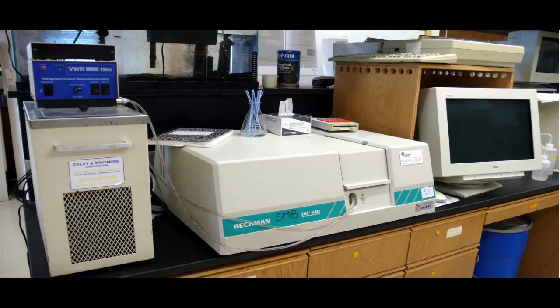The image shown is of a UV-VIS spectroscopy machine. The input of the machine is in the middle where the cuvettes are loaded in preparation for this machine to read. The analysis of the samples is done on the left side where they go through and get light shined on them. And on the computer, the quantification and graphs are shown of these samples.